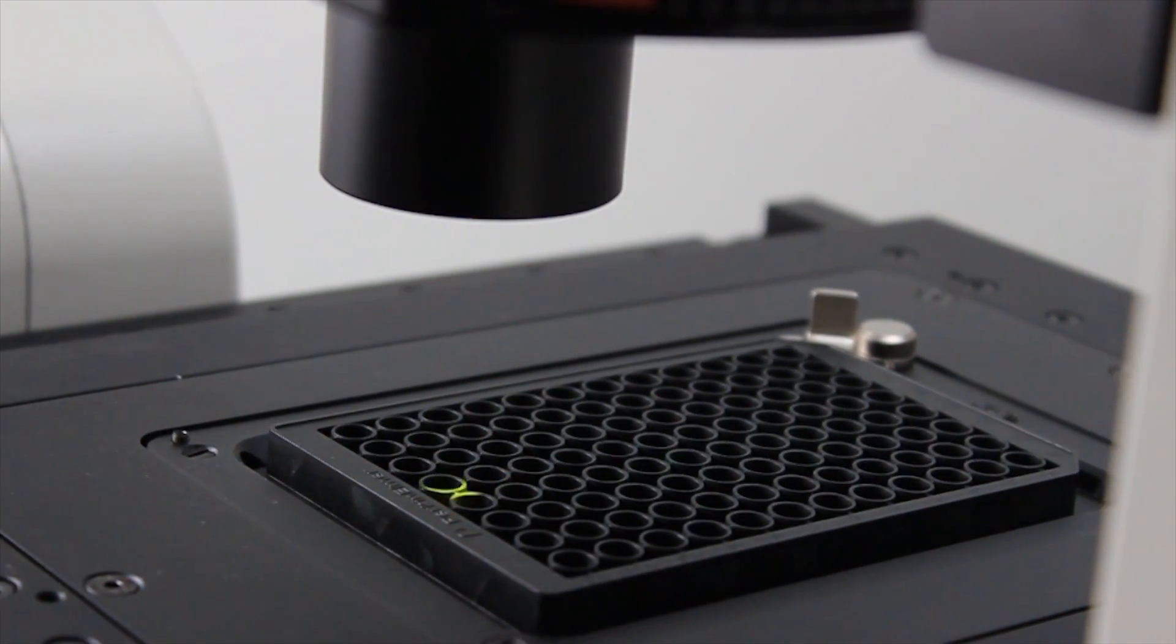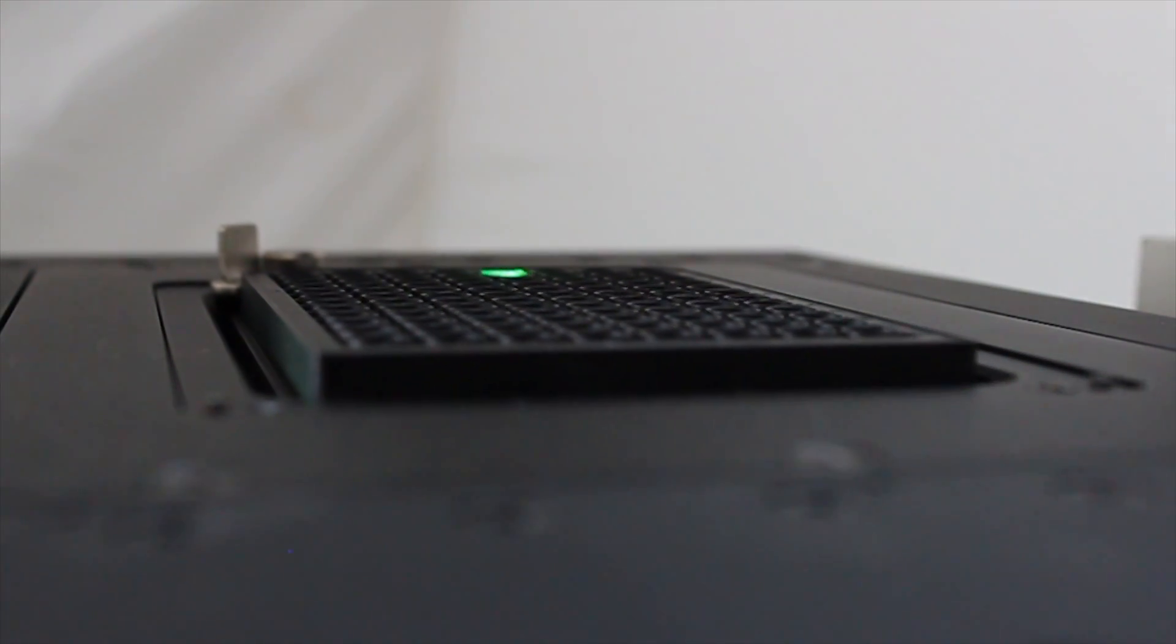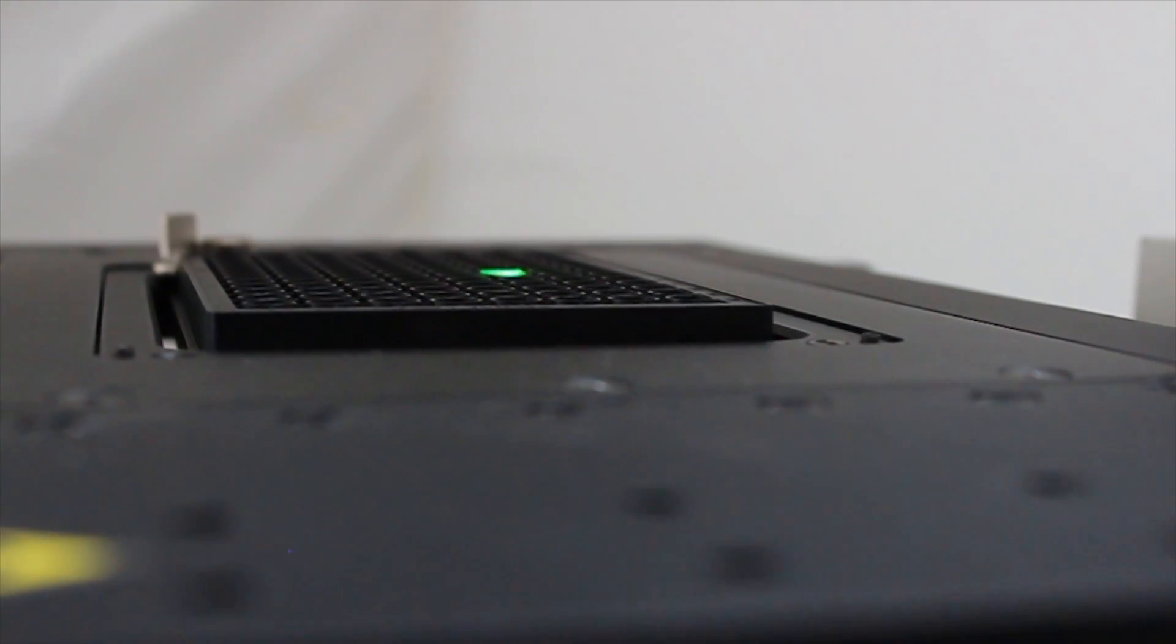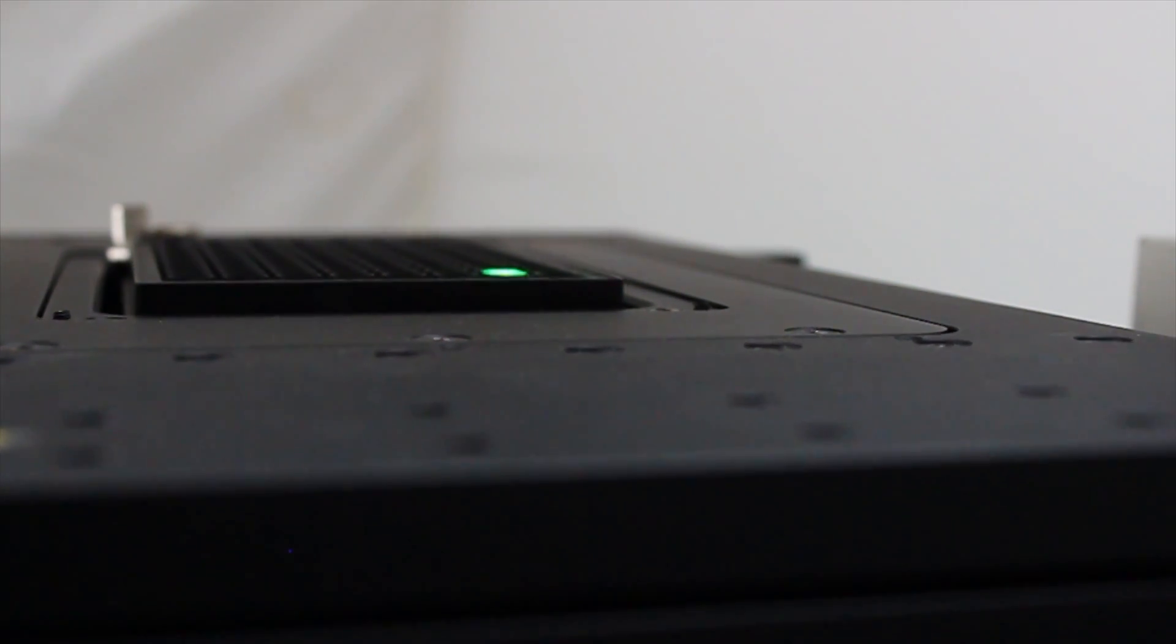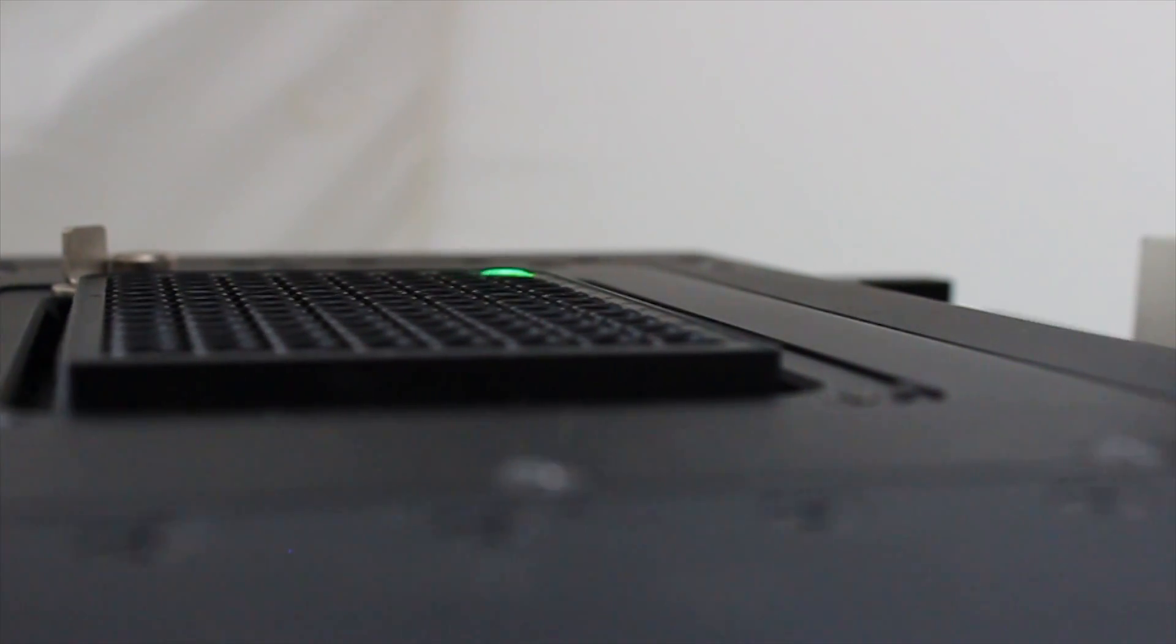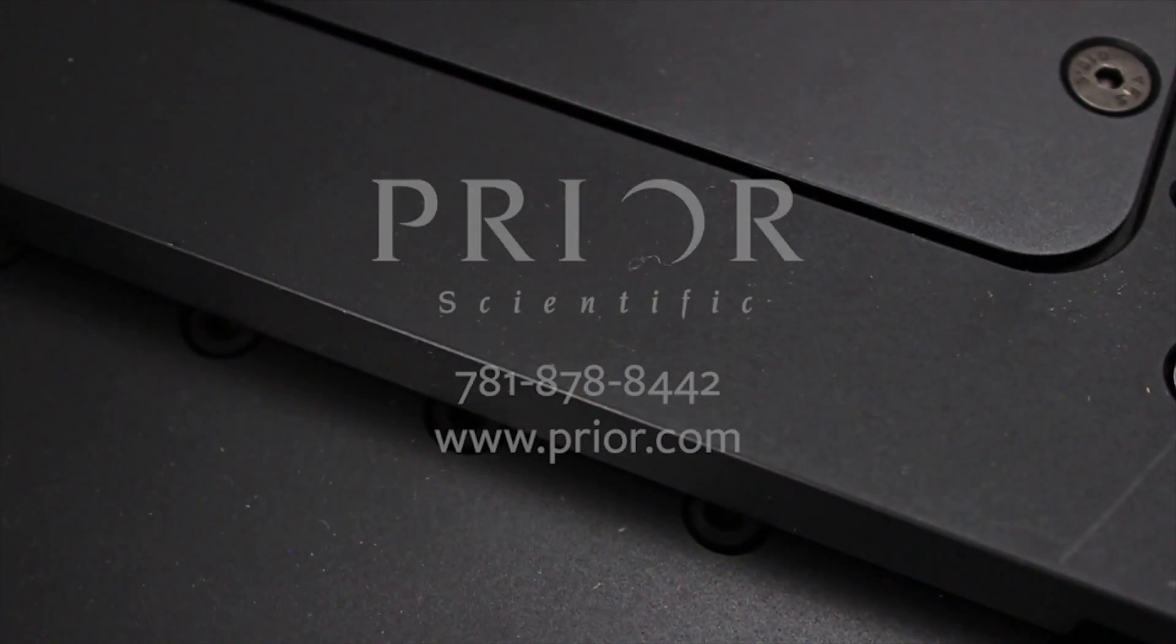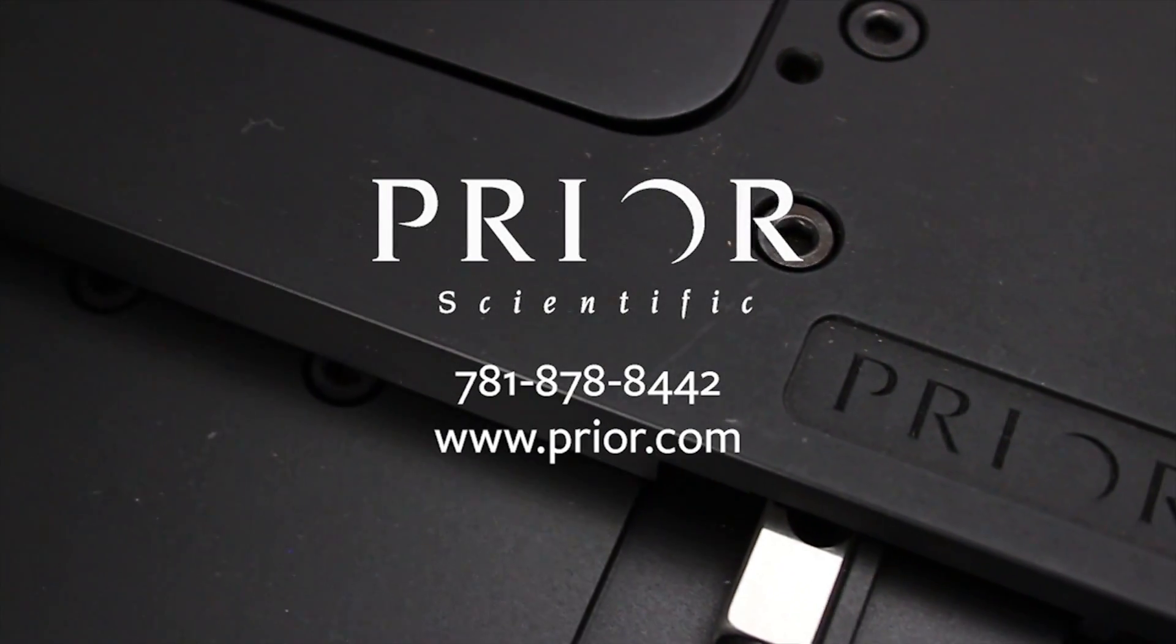Add-on drive modules for solutions for a variety of additional accessories. Scan 96 well plates in as little as 25 seconds, slide scanning at high speed with constant velocity. The HLD117 series of DC linear motor stages from Prior Scientific can take on the most demanding applications with ease.